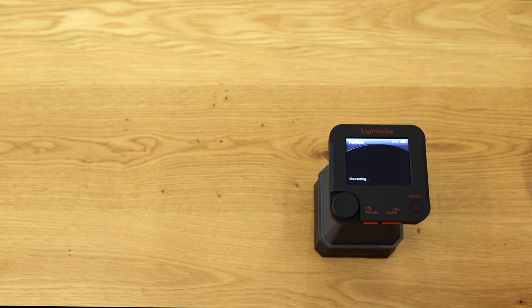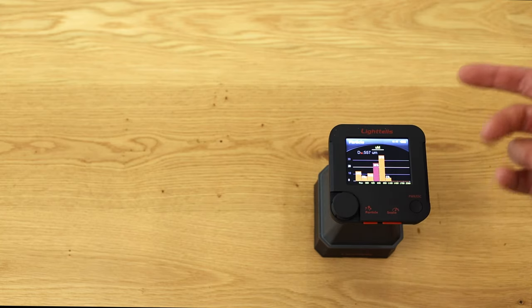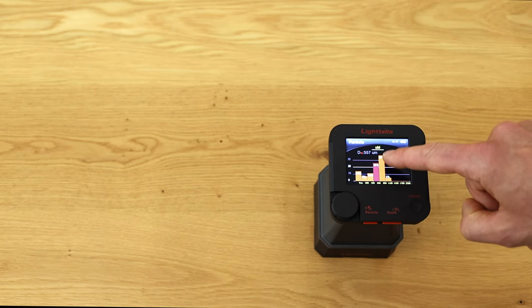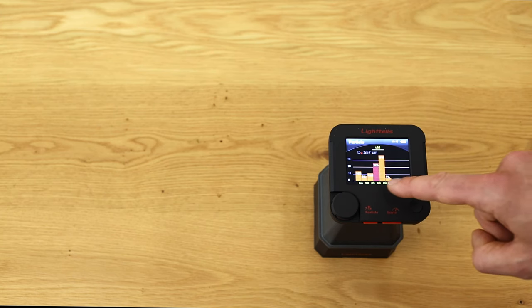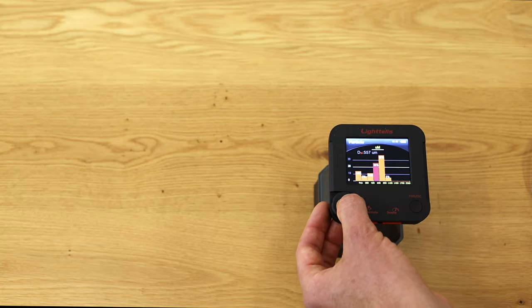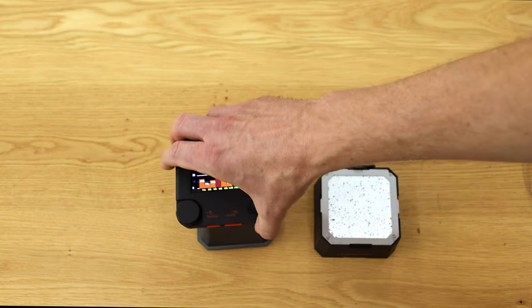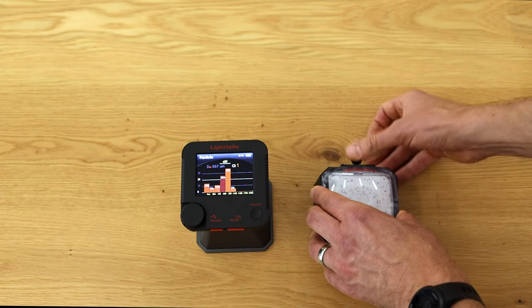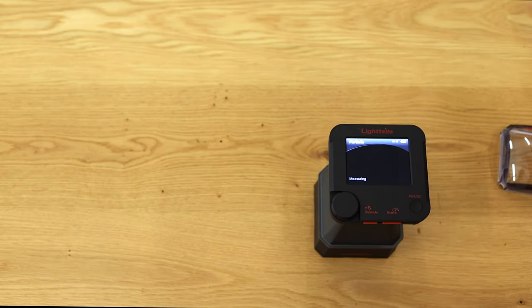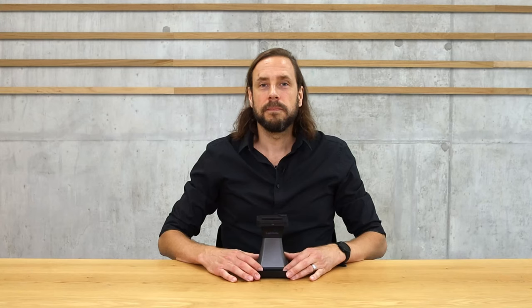Particle measurement takes a bit longer than color measurement. Now I can see the particle size distribution — most particles are in the 600 to 850 micron range at 37%, and I can see how they are distributed across the scale. If you get an error, you most likely used too fine coffee with too many particles — just use a bit less. If I want to take additional measurements of the same sample, I can enable the averaging function to repeat and get an averaged result, improving measurement quality.